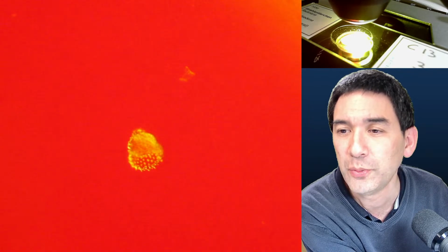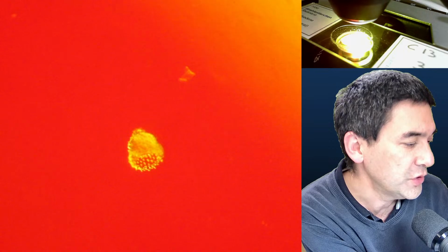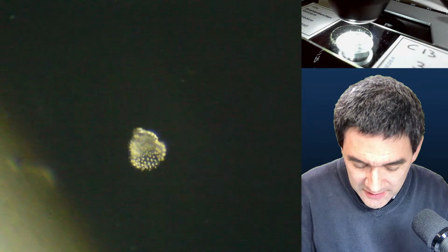What's the difference between a dark field filter and a dark field condenser? Yeah, so this question is also a common one, which was also asked, I think, last week already. It's because you do see in some cases that companies sell separate dark field condensers, and here we've got to be a little bit careful.